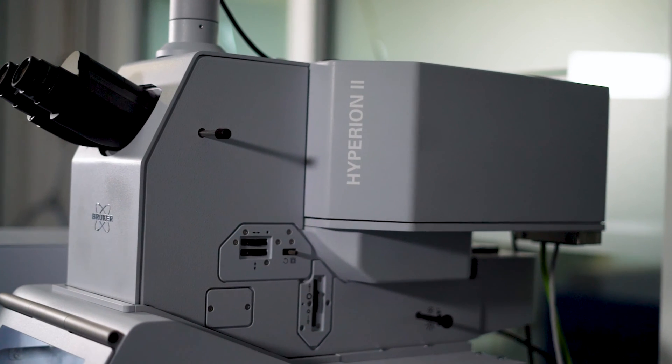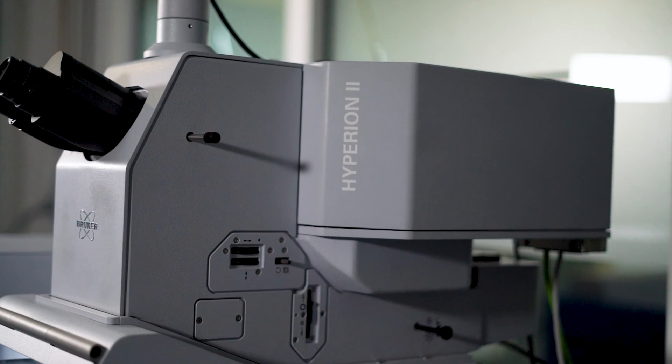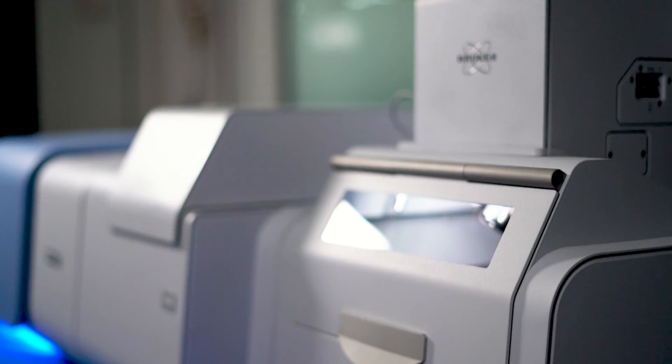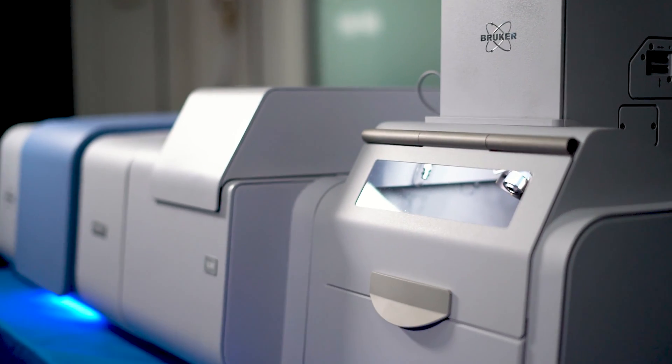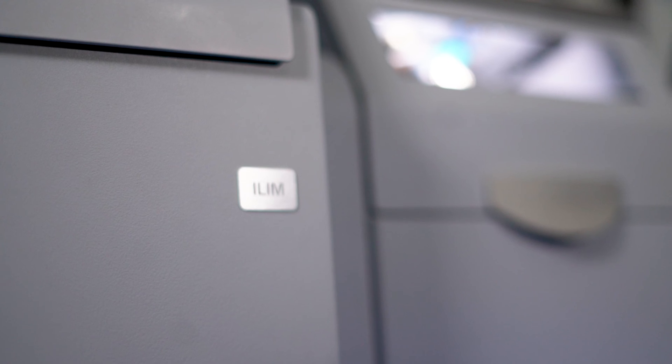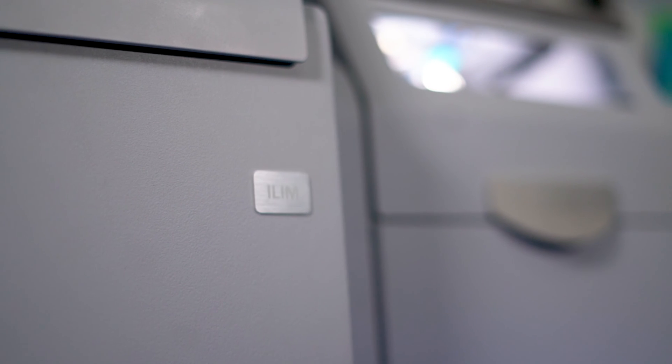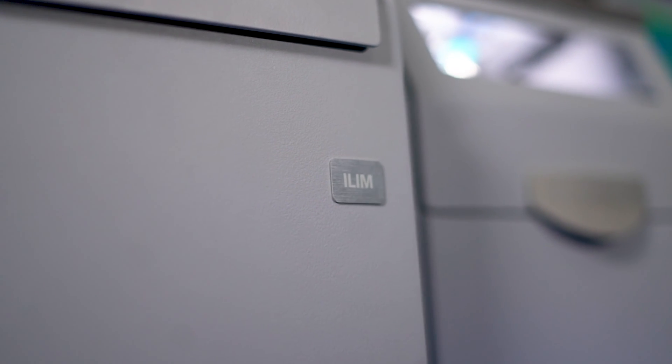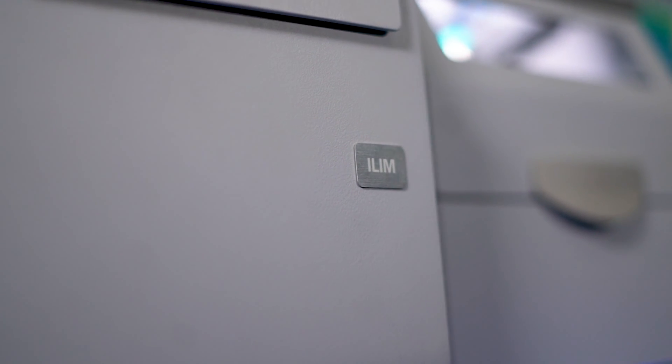This is the Hyperion II ILUM, BRUKER's QCL imaging microscope that effortlessly creates chemical images of complete pharmaceutical tablets. In minutes. You heard correctly. In minutes.